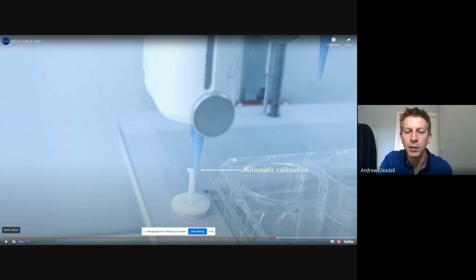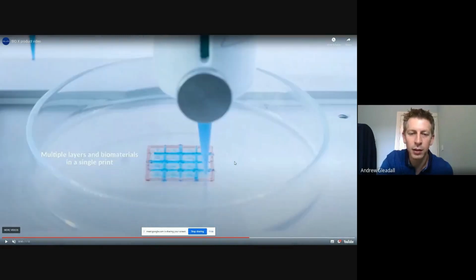This is to make sure that if you try to print, as we showed before, a structure like this one, and the three different print heads weren't correctly aligned, then we could get a shift. All this blue grid might not match up perfectly with the outer red grid, and these droplets might have been printed on the intersections rather than in the grooves. So that's an important aspect.